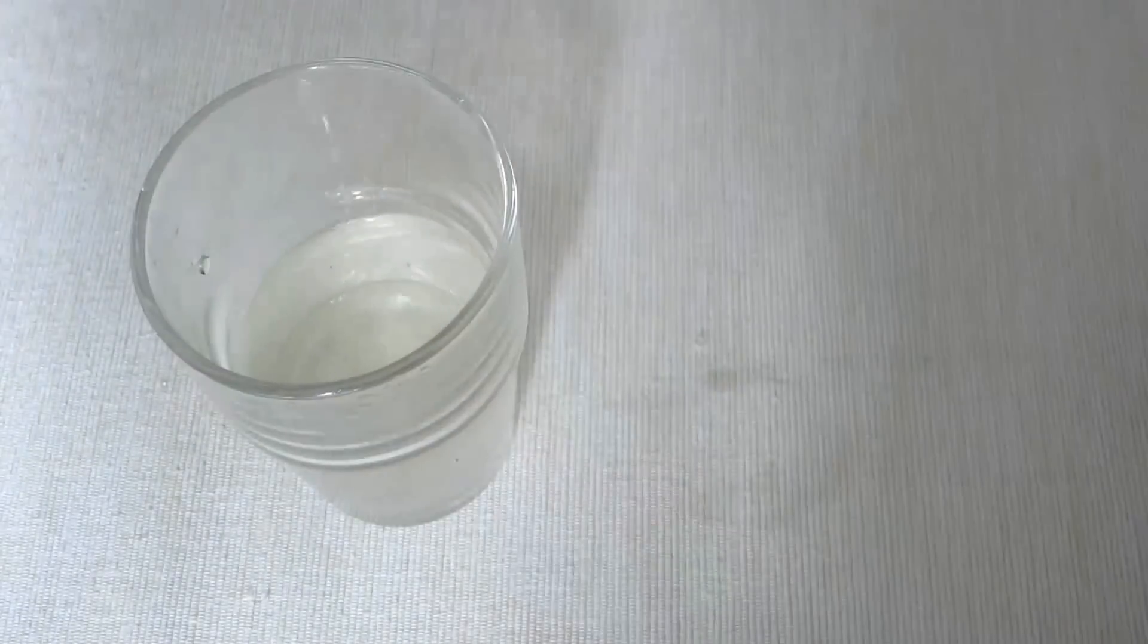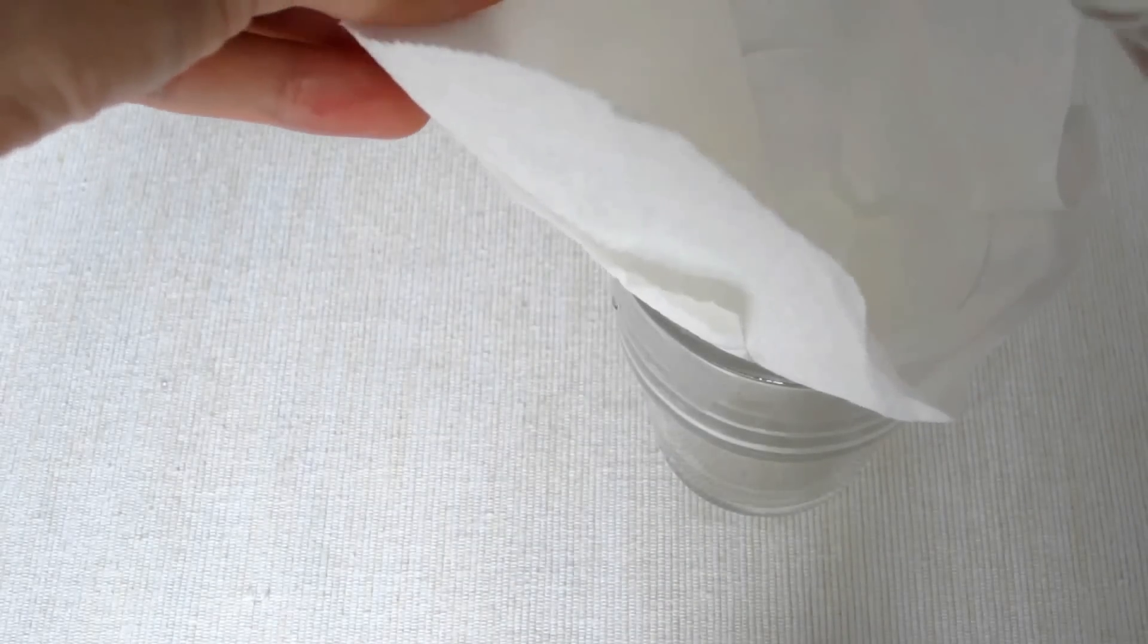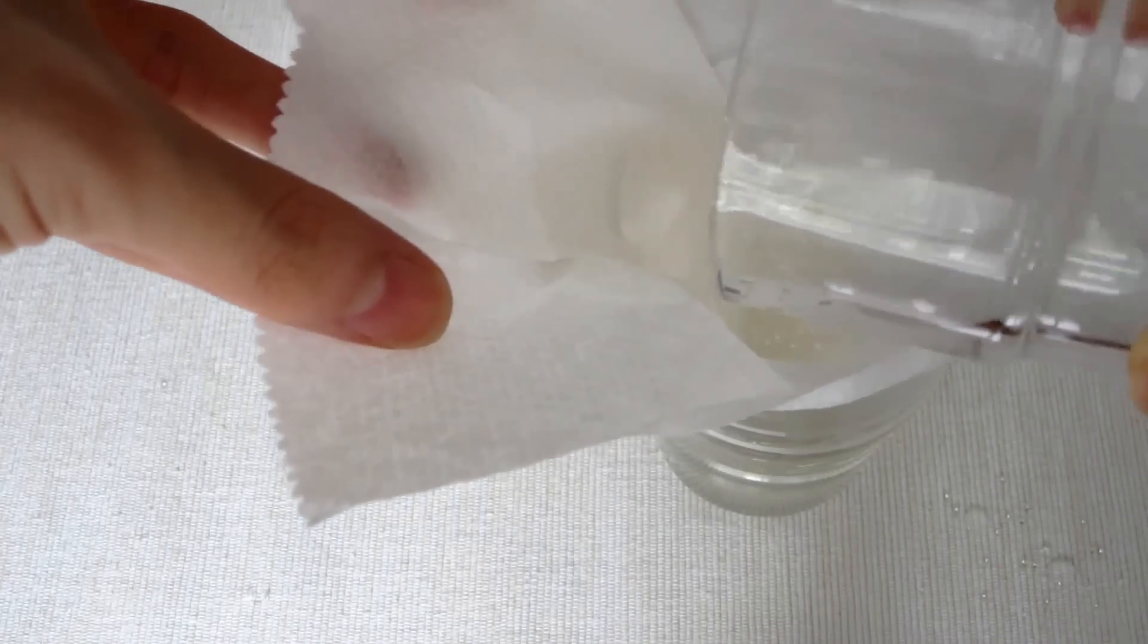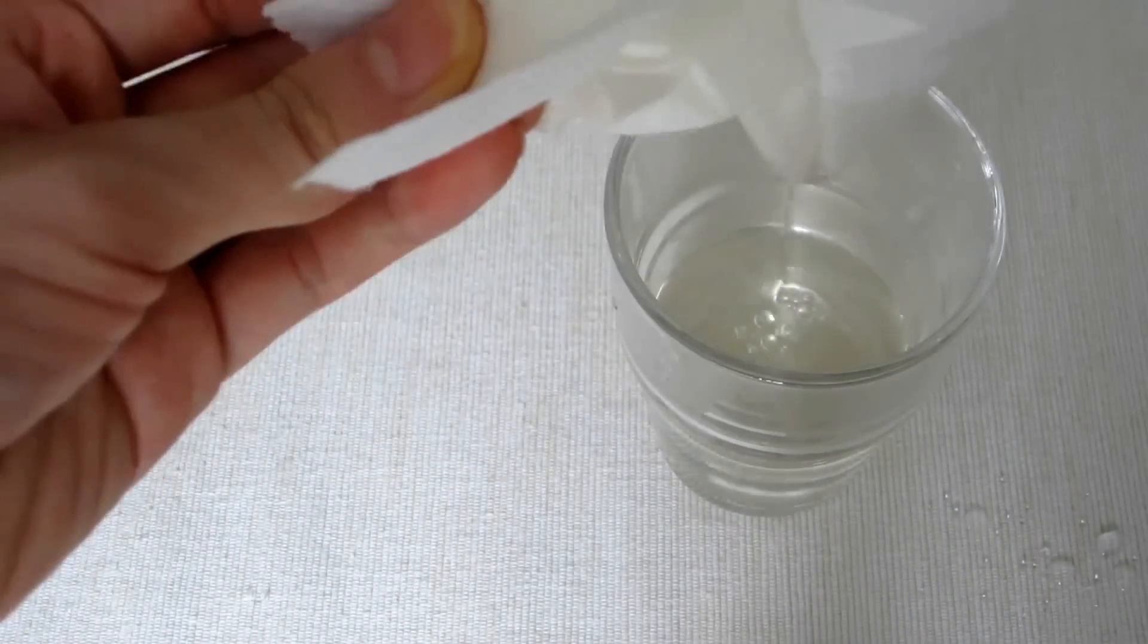Filter the solution in order to filter out dust, insoluble substances and excess alum. You can use filter paper and funnel. If you don't have filter paper, you can use multifold towel paper.